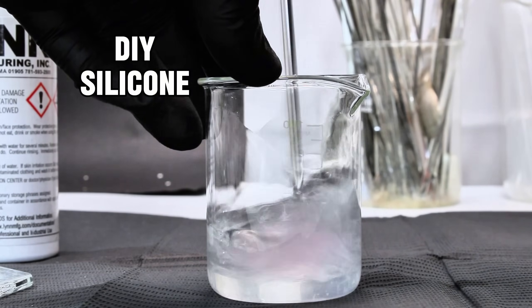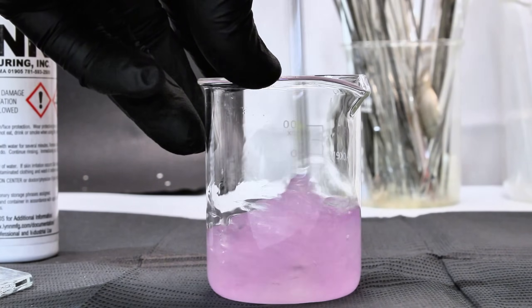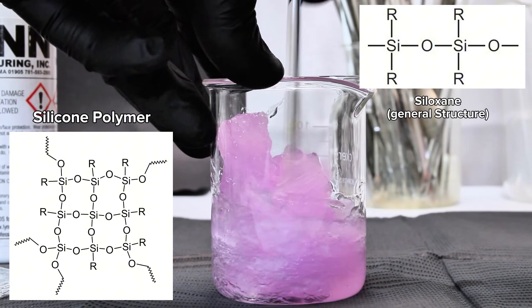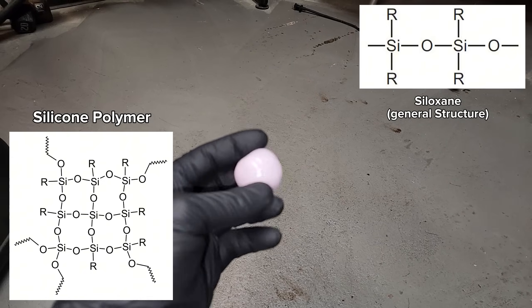Today I'm going to show you how to make a simple silicone polymer that I used to make a super bouncy ball. Chemically speaking, silicone is a polymer made of repeating siloxane units. This is the general structure of a silicone polymer, where R is basically any organic functional group.